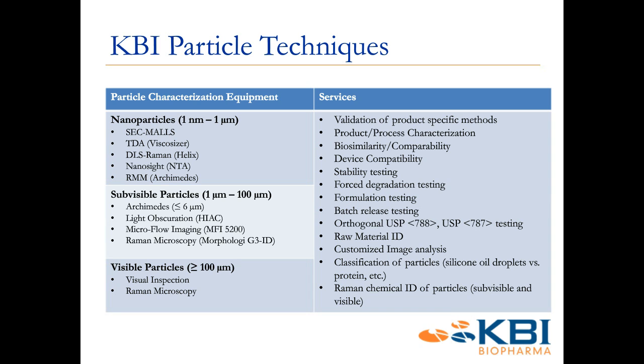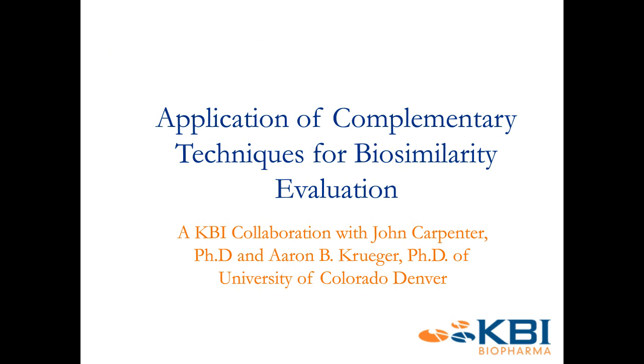And we use these tools for a wide range of services. Obviously, we can't provide client data that's confidential, but we do have a couple of studies which I will present, which are collaborations with some of the universities or data we've collected in-house for internal use, which I'll go through today to show examples of how we use multiple techniques to characterize products. So the first example here is showing how we can use multiple techniques to evaluate biosimilarity or comparability.